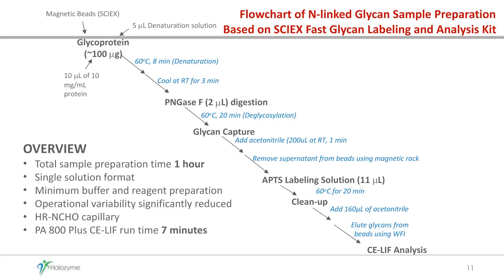There's minimum buffer reagent preparation because everything comes in the kit, and obviously the operational variability is greatly reduced. We did use a high-resolution N-CHO capillary. I believe they have switched that to another capillary, but it should work the same way.